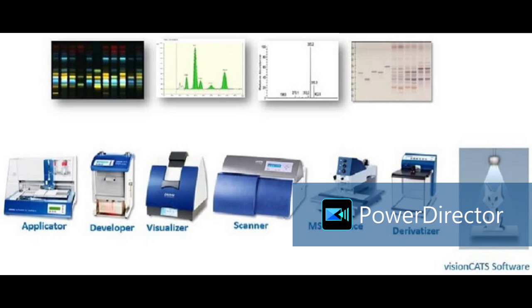Then a scanning densitometer to scan the plate. Just keep the plate inside the scanner. The scanner will generate 190 nanometer to 900 nanometer wavelength light, with 3 lamps. Again there are 3 lamps: deuterium, tungsten, mercury. But now here we are using a monochromator to chop each single wavelength. Earlier there were only 3 wavelengths, 254, 366 and 540 white light. But here all wavelengths are available: 190, 191, 192, 193 up to 900. We can select any single wavelength for scanning the plate.